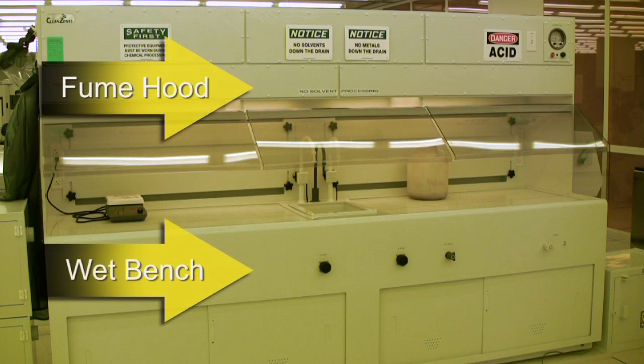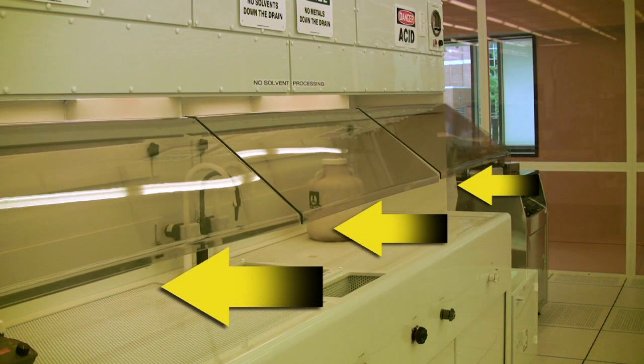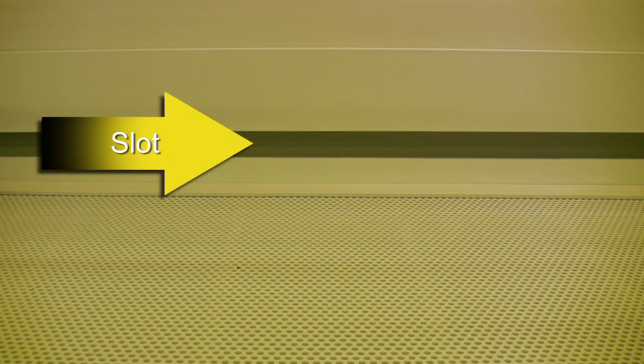The slot ventilated fume hoods consist of the fume hood and the wet bench, which is the work area underneath the hood. The basic function of the slot ventilated fume hood is to have a continuous flow of clean air pulled from outside of the hood into the work area underneath the hood without letting the fumes out. The air is pulled through the slots located at the base of the fume hood where the hood meets the back of the wet bench.